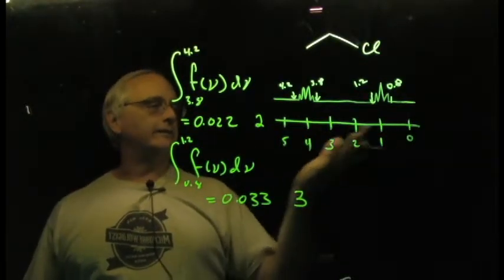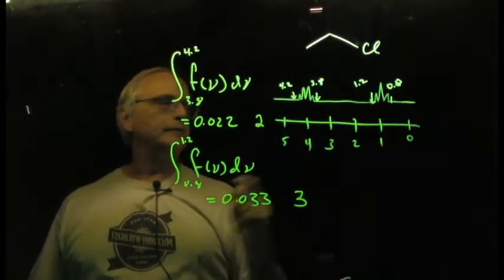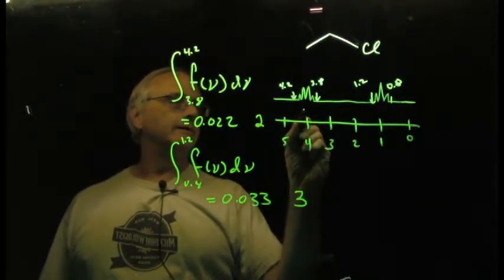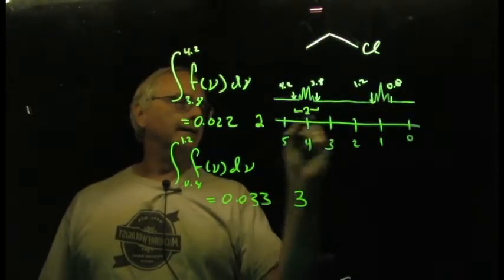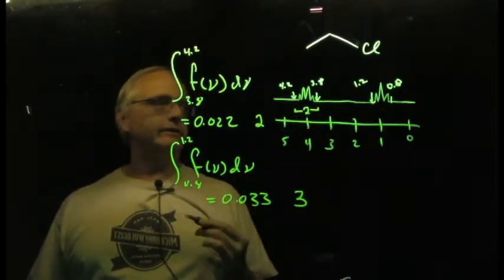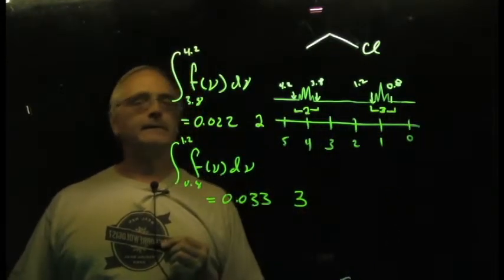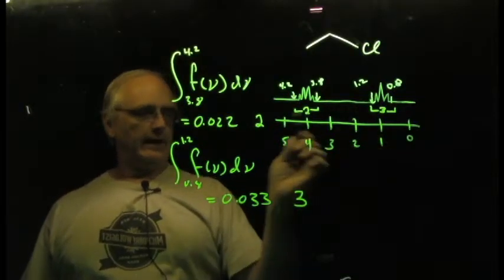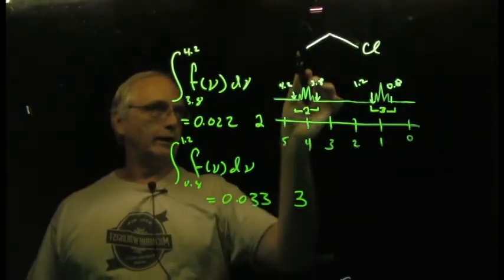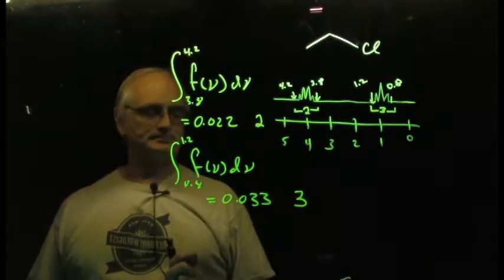You will usually see them displayed in the spectra that we're going to make use of, usually as a number printed below the peaks, often with a little bit of a line on them to indicate the range that you actually did for integrating. So it'll look something like that in the spectra that you see. And there it is, the classic 3:2 ratio, representing 3 protons in this group, 2 protons in that group.